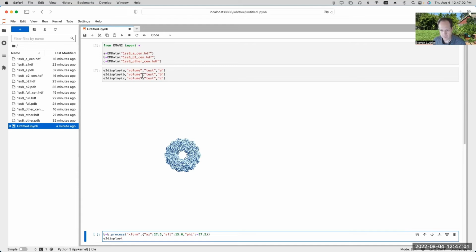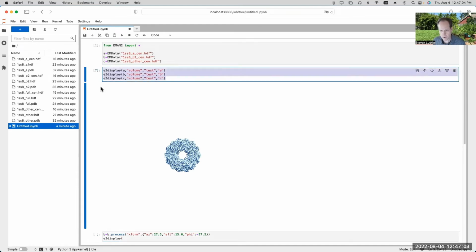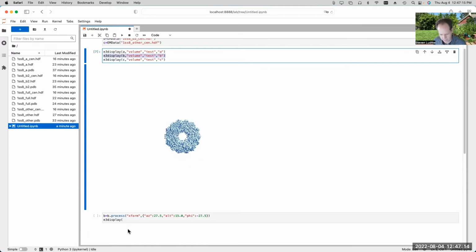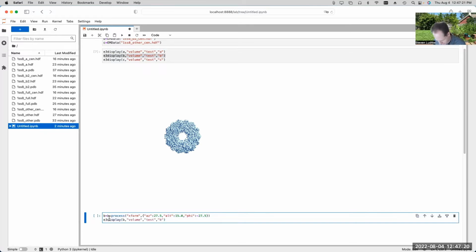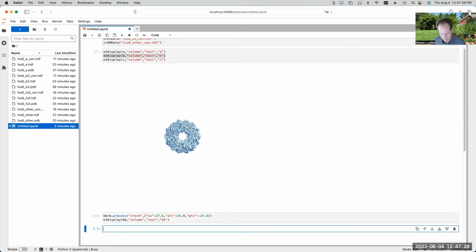Let's go ahead and do the same thing we did up here, but I'll just add it to the same space. Yeah, like that. And we're going to say BB instead of just B, so it's a different volume. Give it a different name. All right, there we go.